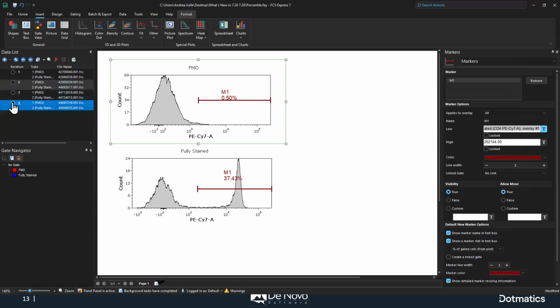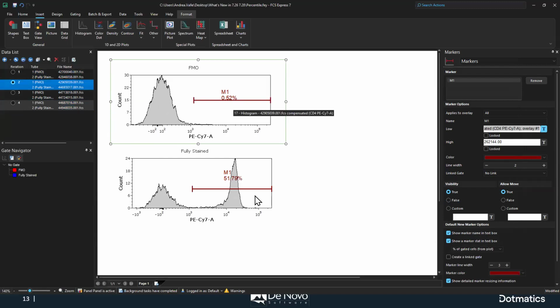You can see here. Those are very small files, so because of the rounding, you might see like 51, 051, 052, and so on. But anyway, this is a great application. If you want, you can also lock. So in this case, the left boundary of this marker won't be adjustable manually, only if you unlock it.